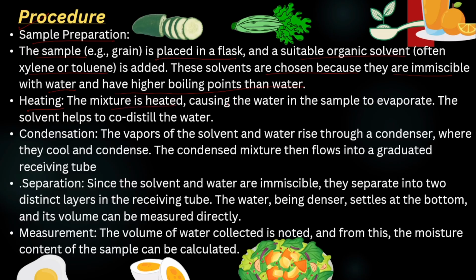Next is the heating. The mixture is heated, causing the water in the sample to evaporate. The solvent helps to co-distill the water. Condensation. The vapors of the solvent and water rise through a condenser where they cool and condense.